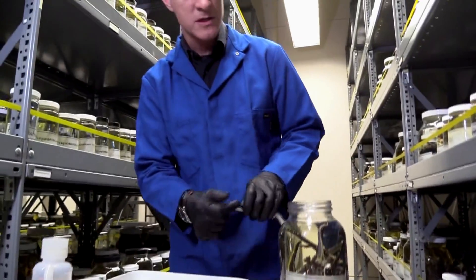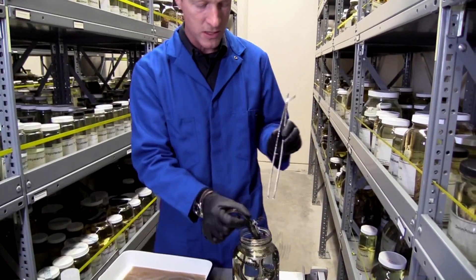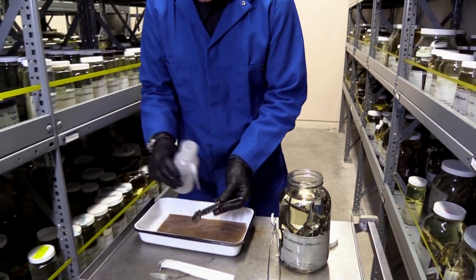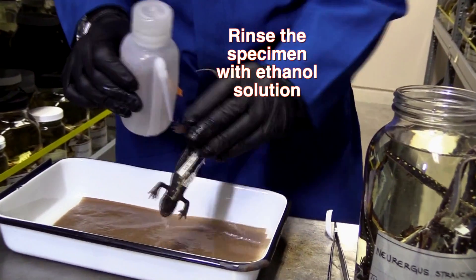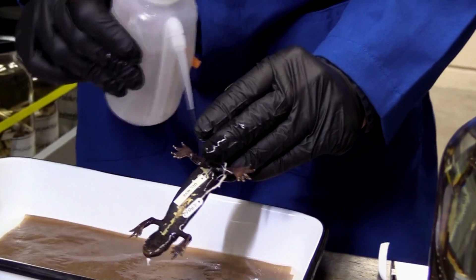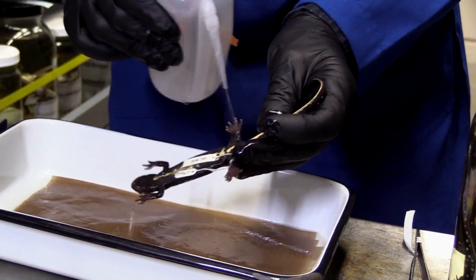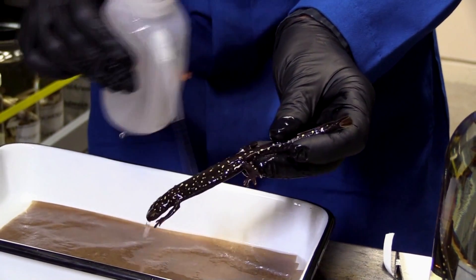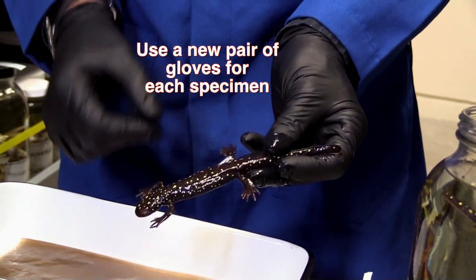That is a perfectly reasonable question. What we do is take the animal out and the very first thing we do is spray it down with ethanol — the same liquid that's in the jar they're housed in. The idea is that if there are any pieces of skin that have floated off another animal, they'll be washed off. The second thing we do is change gloves between each animal.